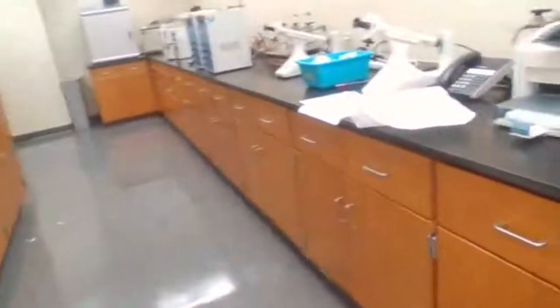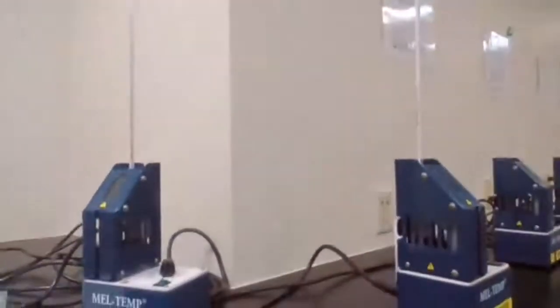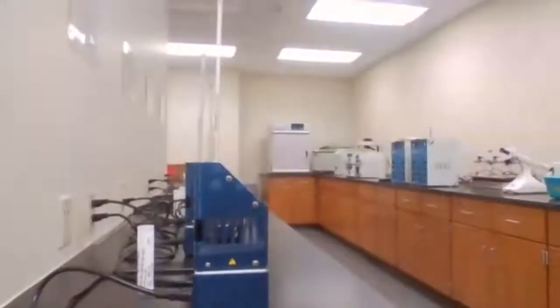And then we have other equipment, some of which will be used for organic 1 and 2 for you: the IR machine, the polarimeter, and other equipment that we have.